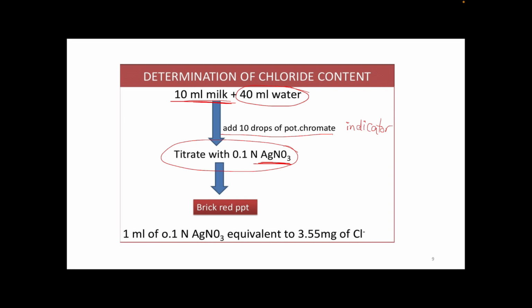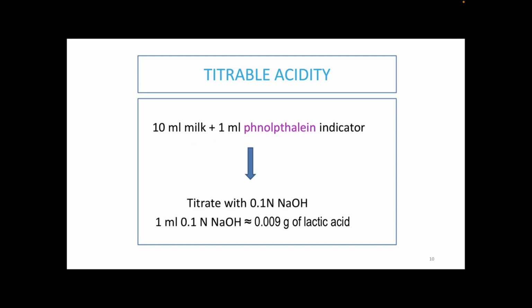Okay, the endpoint is the formation of a brick red precipitate due to the formation of silver chromate precipitate at the end point.